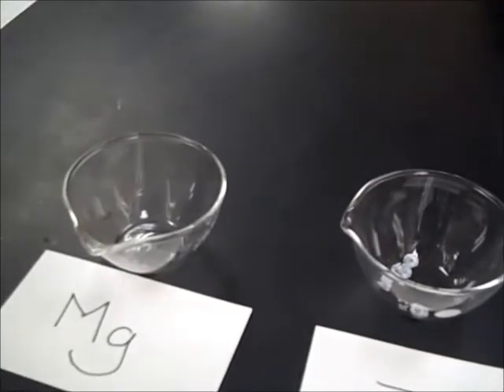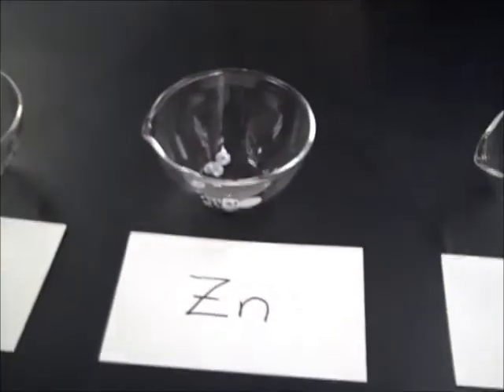That was much more exciting than the water. Yes, it was. It smells amazing. Okay, great. Bubbles, fumes, reacted quite quickly. All right, excellent.